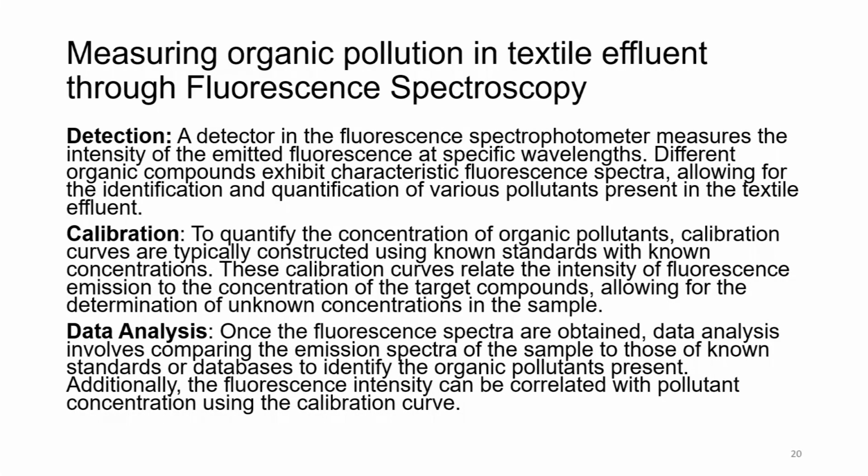Calibration. To quantify the concentration of organic pollutants, calibration curves are typically constructed using known standards with known concentrations. These calibration curves relate the intensity of fluorescence emission to the concentration of the target compounds, allowing for the determination of unknown concentrations in the sample.